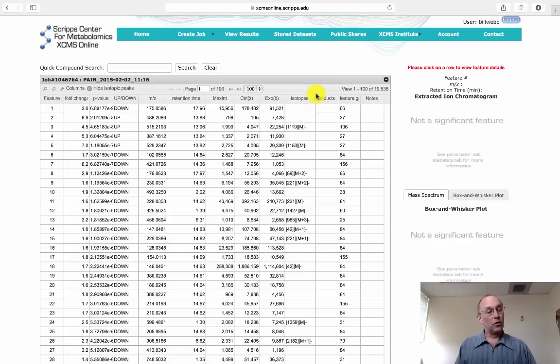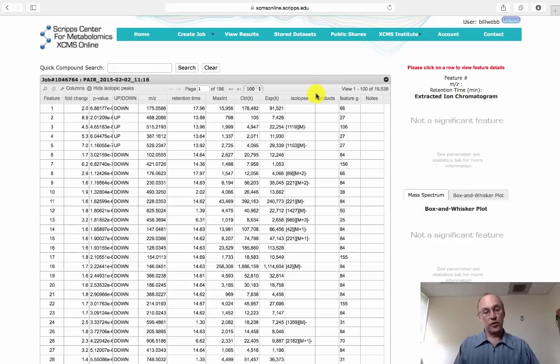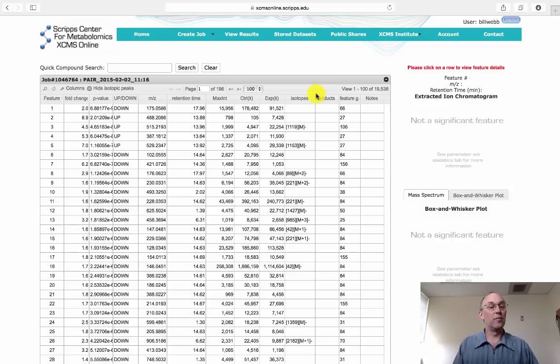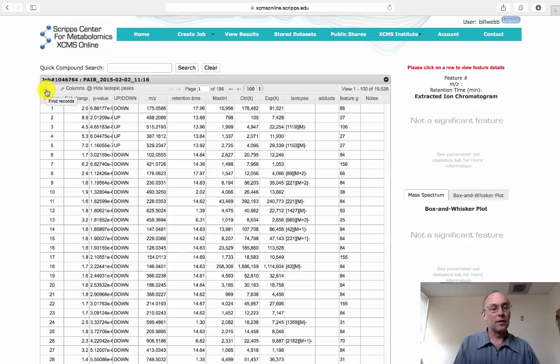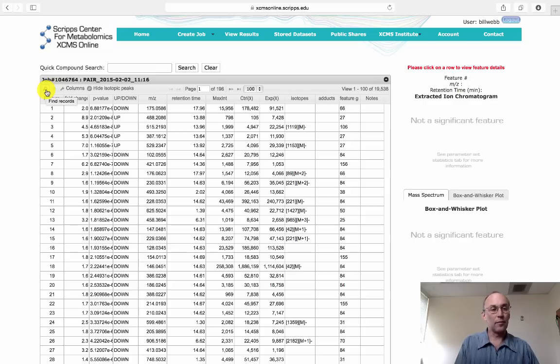What we'd like to do is filter through all these features so we're only looking at the most significant ones, or the ones that differ the most. To do that, we'll use this magnifying glass icon in the top left corner, the Find Records icon, and click on that.